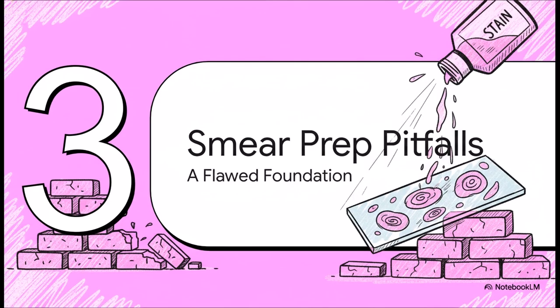And that's a perfect lead-in to our next big topic. Because you know what? Some errors happen before you even uncap a single bottle of stain. A flawless staining procedure just can't rescue a badly prepared smear.